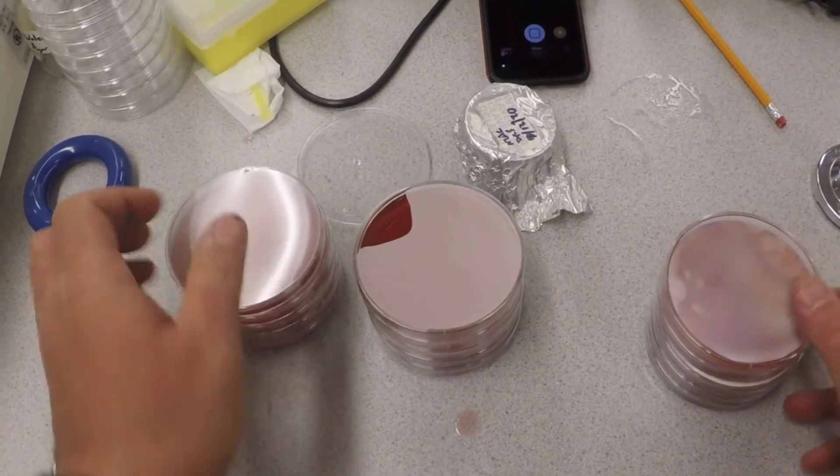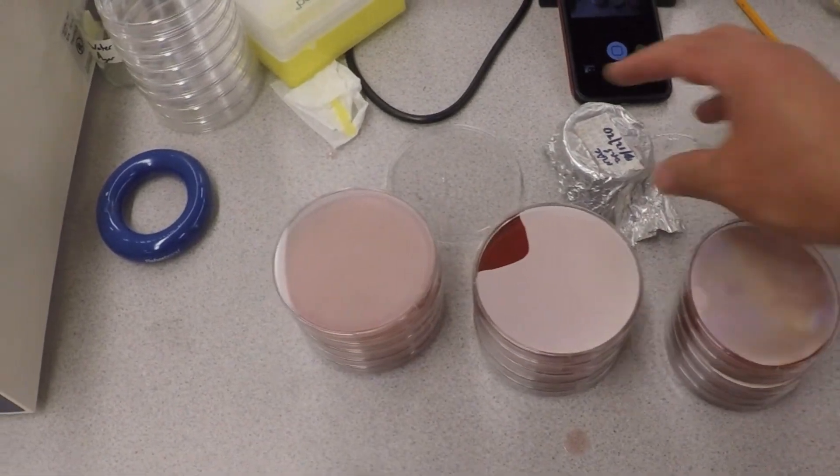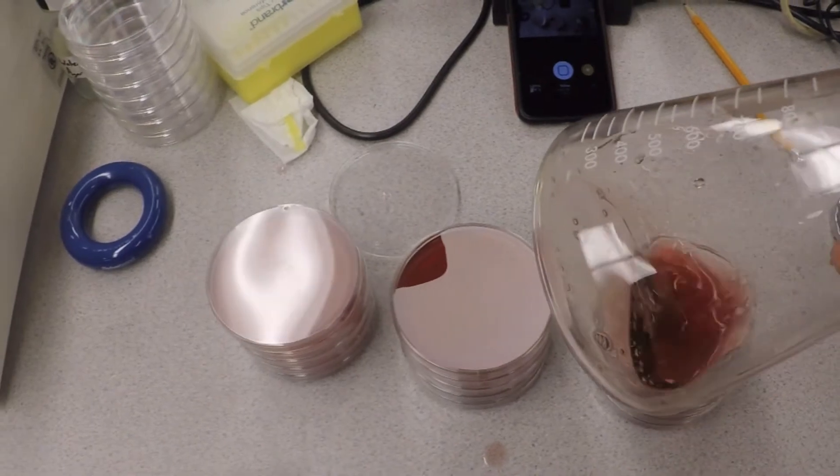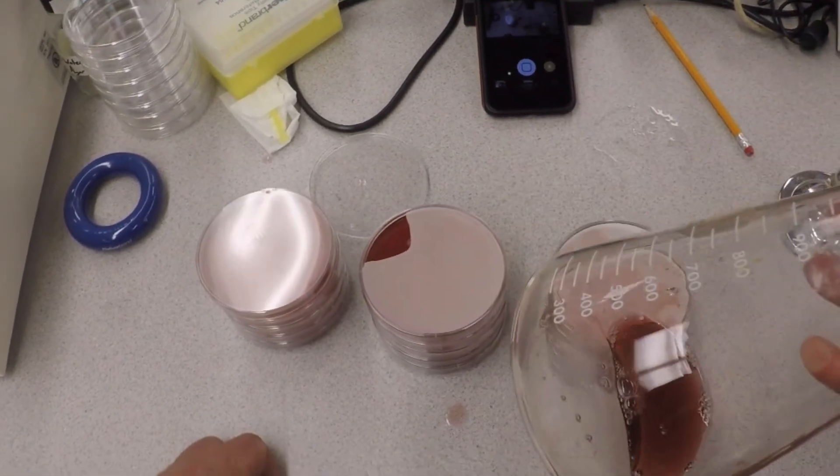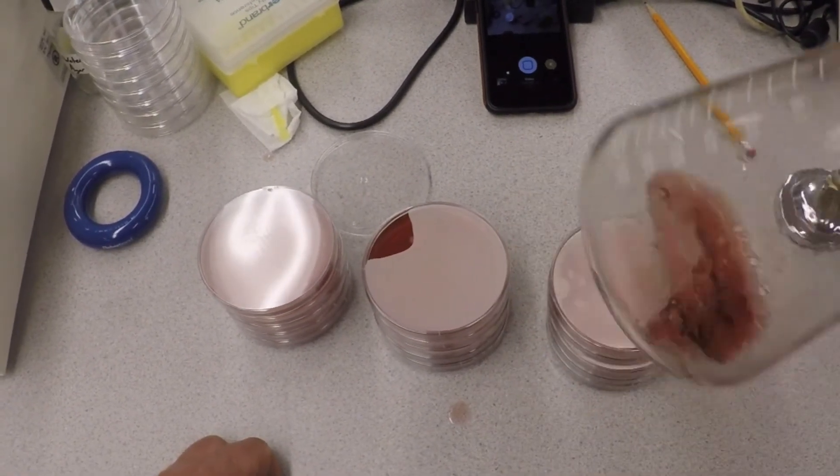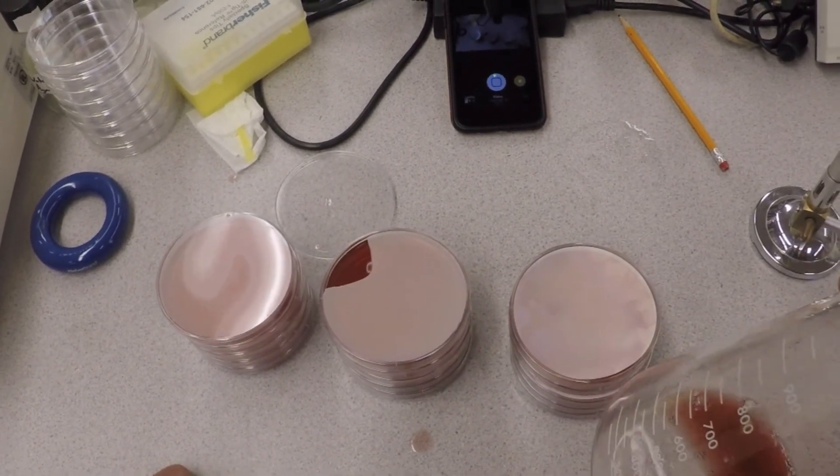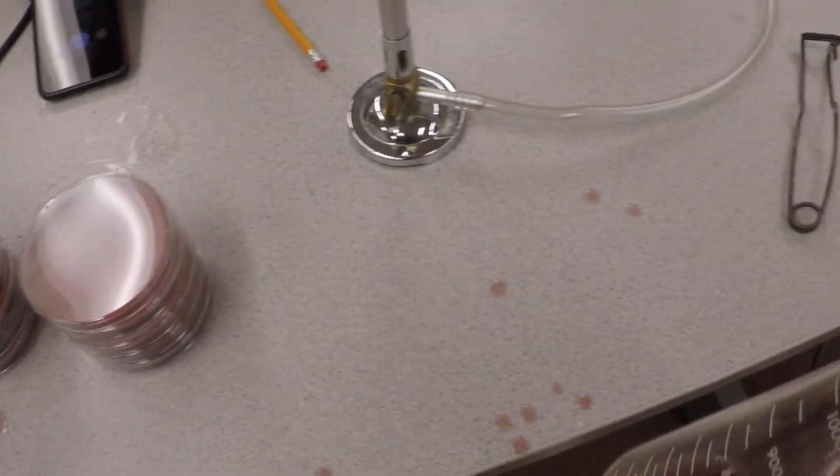Now you just let these babies solidify on the bench. Put some water in this thing before it solidifies—you don't want to pour this down the sink because it'll solidify in the drain, and that's a problem. Ask me how I know.